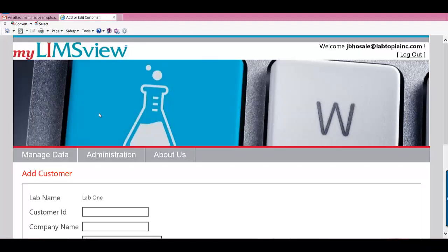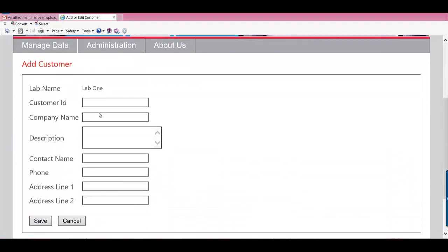Additional items that you can add can be done through integration. One of the features that we have is we can integrate through views to your LIMS database and with web services, and we can pull information that you have. So let's say you have a customer ID or some type of company name ID, or however you choose to identify your customer. We can pull this information over into the system if needed, or only pull the customer ID so that it has a unique code, because we associate each customer with all of their contacts by that customer ID. That way, when the contact logs in, they're not looking at other customers' information, they only have access to their own information.